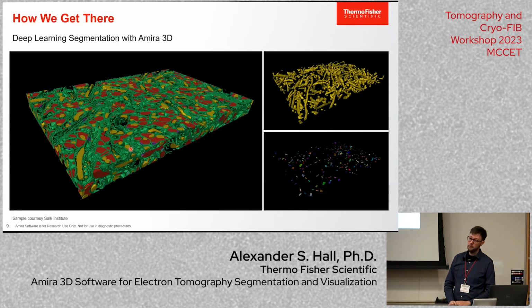And if you weren't aware, mitochondria are not usually spherical. They tend to have a pretty oblong shape, and there's a lot of variation. So you can see that intuitively with the segmentation data. You can also measure that, of course, but seeing is believing for many people.